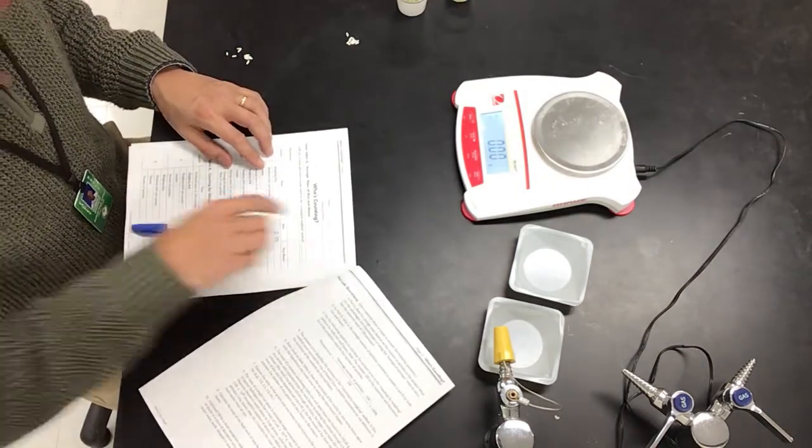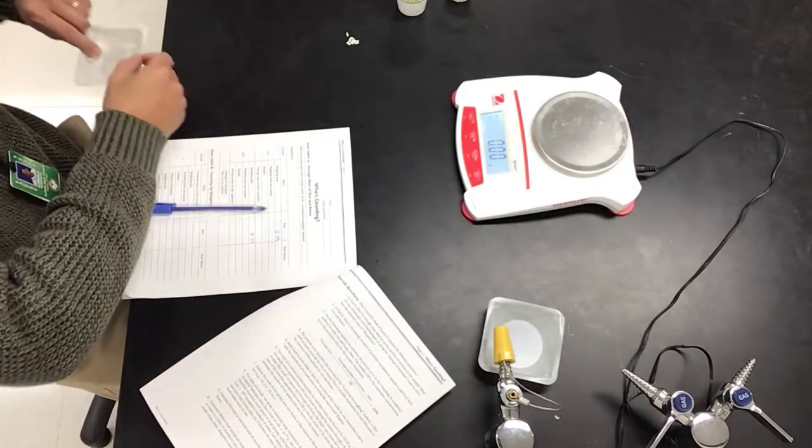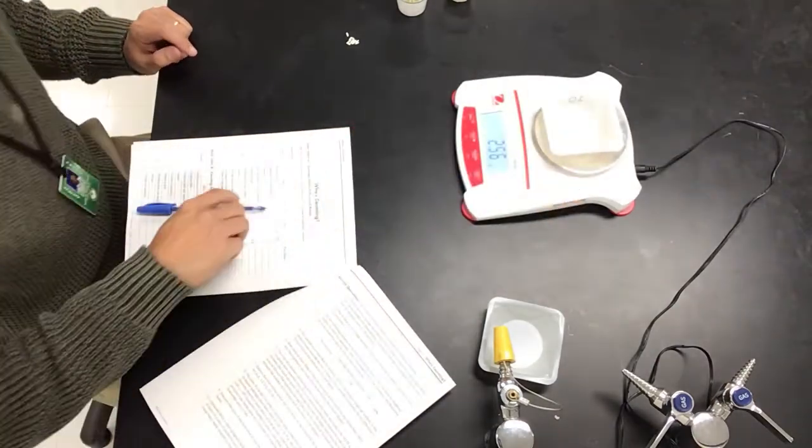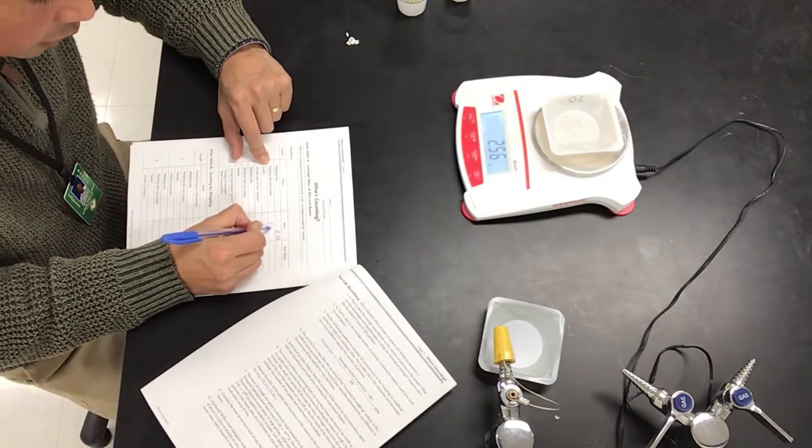So now we count out 10 grains of rice. I already have it here. I'm going to put it all in there. That's 10 grains. I'm going to weigh it again. The weighing dish and the sample weighs 2.56.